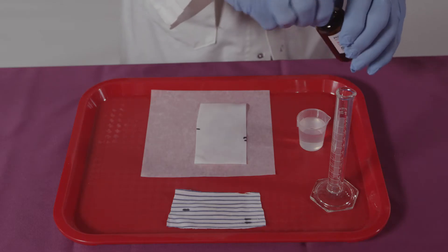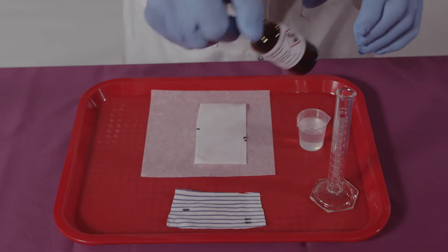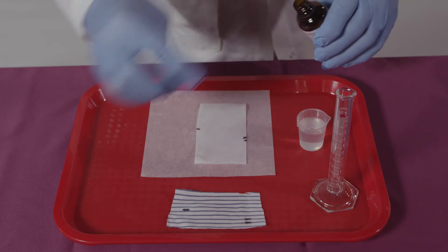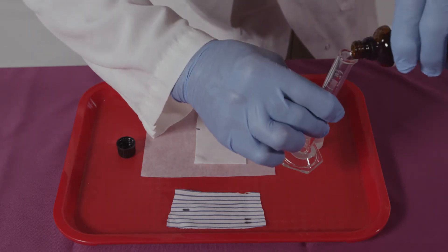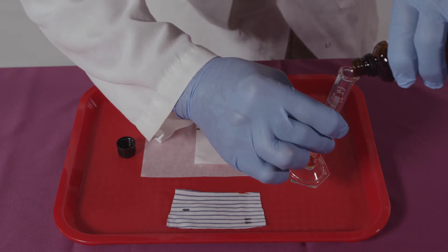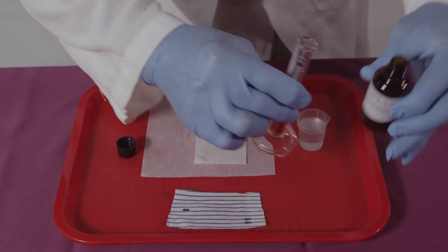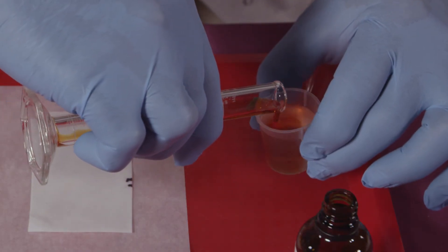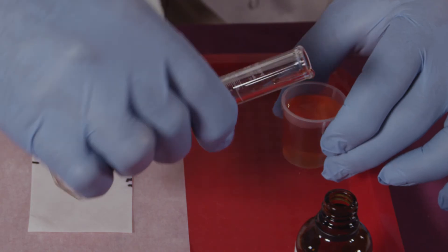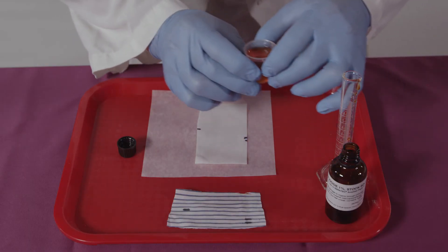A working solution of iodine must be prepared from the supplied stock solution. Two milliliters of stock iodine is added to 28 milliliters of water. This prepares 30 milliliters of working iodine solution.